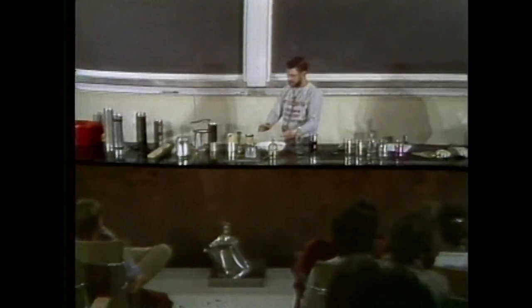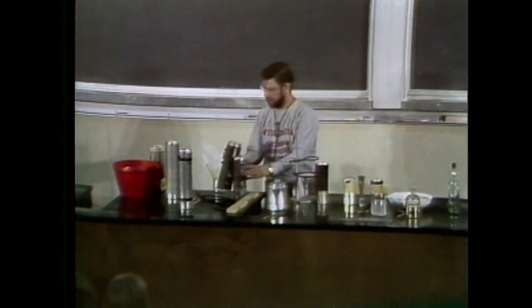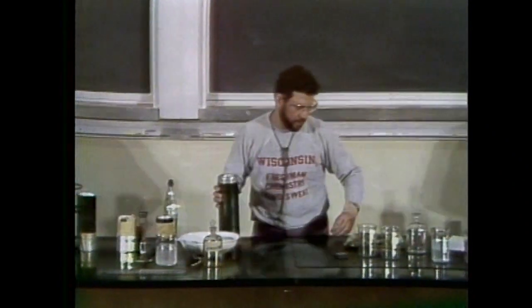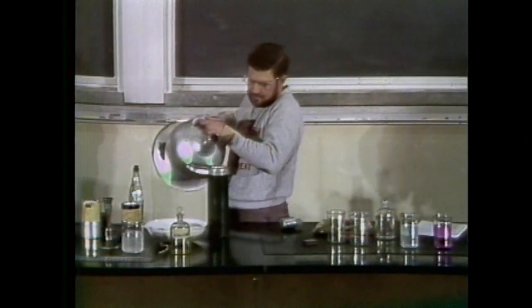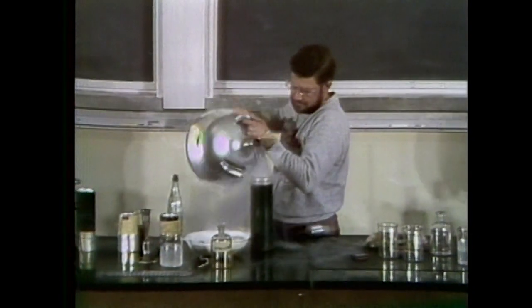I'll tell you what, Bucky, I've been doing some demonstrations with liquid nitrogen here, and let me do one for you. Maybe this will make up for all the things that have happened so far. Of course, I need a little more liquid nitrogen here, so I've got it. When you're around, Bucky, we go big, big style.